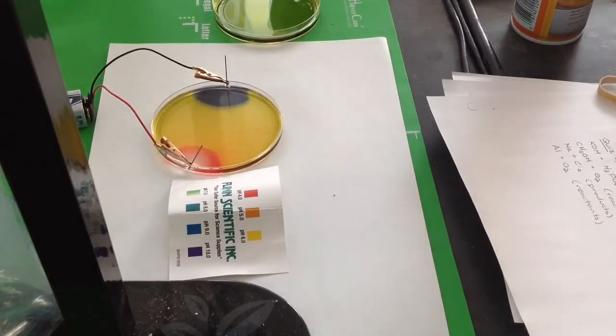Is the white extremely acidic? What's that? Is the white extremely acidic, or is it just one of the others? I think what you're doing there is you're probably getting the oxygen. I'm not really 100% sure. The universal indicator doesn't go past red, so I don't know what the clear is. It's probably just reacted, and the oxygen is probably pushing the indicator out of it. But it'll keep going and keep going unless we mess with it. So you messed with it?